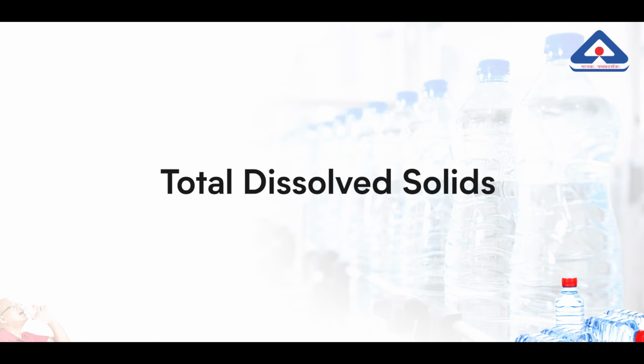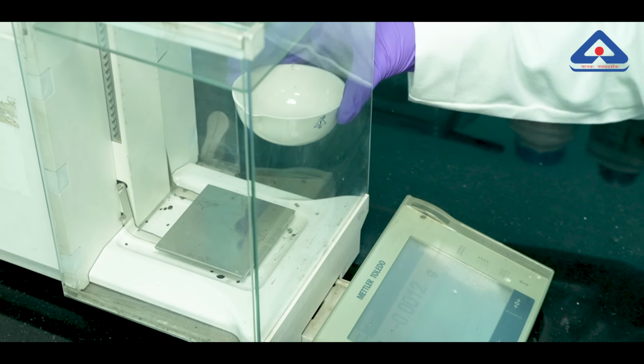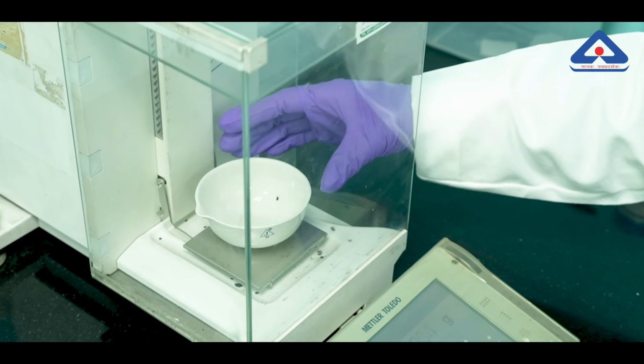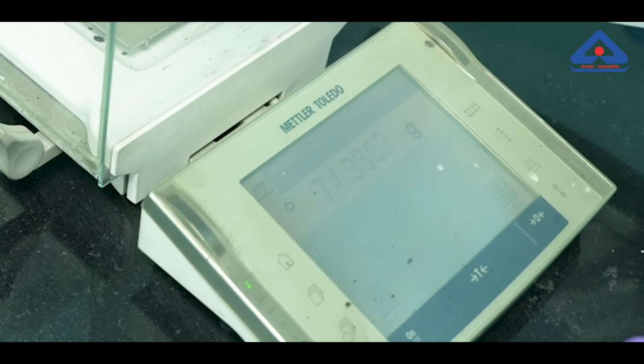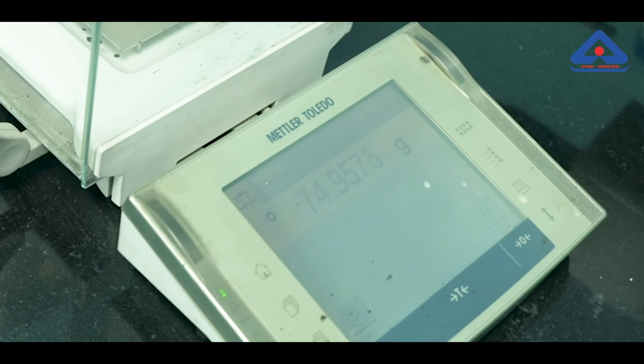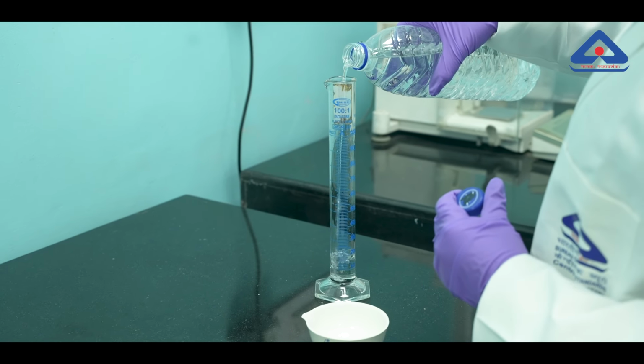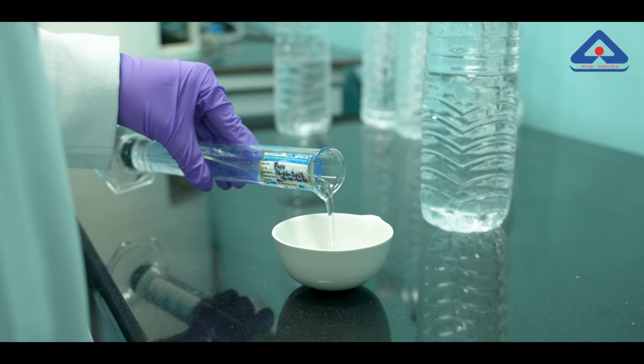Let's explore the procedure for testing total dissolved solids, or TDS, in packaged drinking water using the gravimetric method. We start by preparing a clean, previously dried evaporating dish. We accurately weigh it and record the initial weight. A known volume of water sample, typically 100 milliliters, is transferred to the dish.